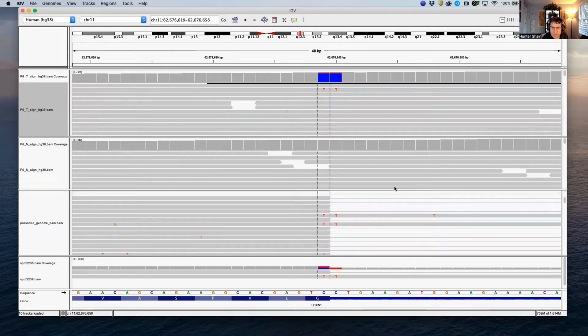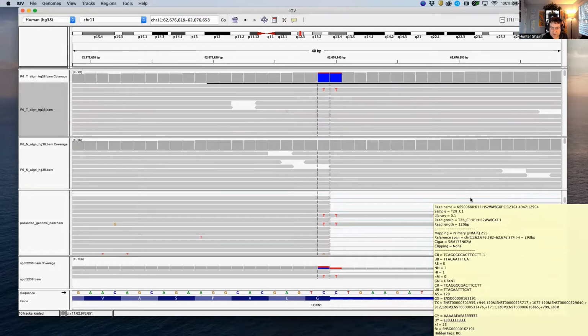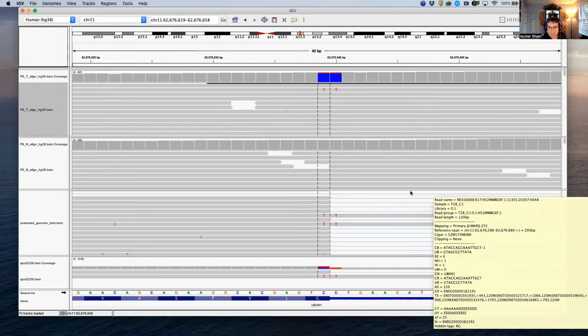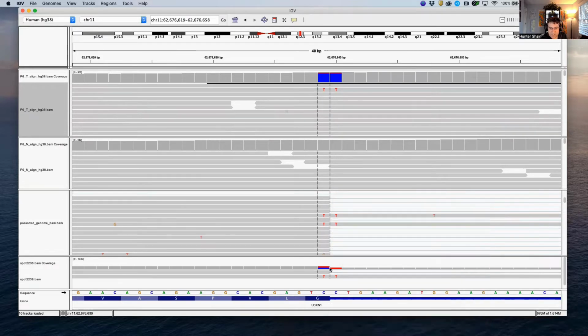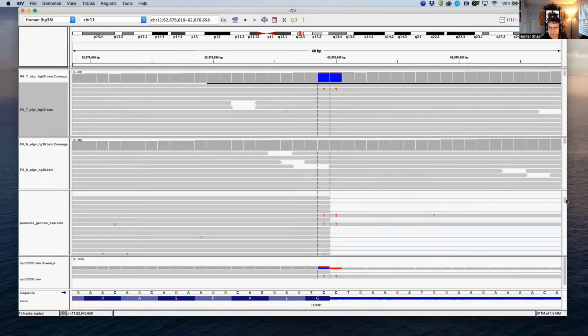Now, interestingly, whenever there is a mutant read, you'll notice that there's improper splicing. And so this suggests that not only is this mutation expressed, but when it is expressed, it disrupts this predicted splice site and results in a read-through of this intron.